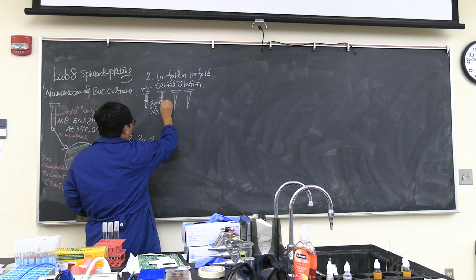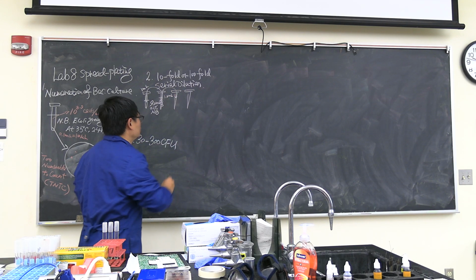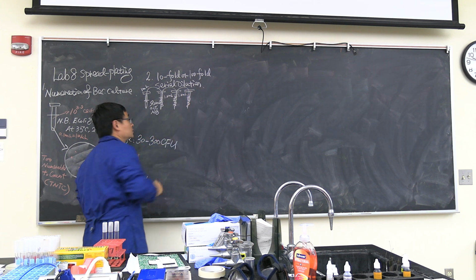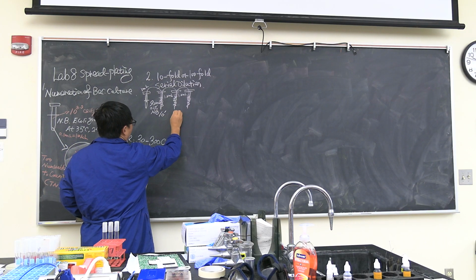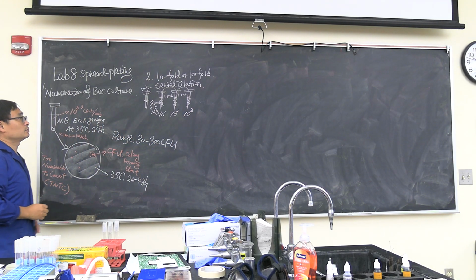Then we mix very well, we shake or vortex, and then add 1.0 ml to the second tube. We mix, shake very well, then we add 1.0 ml to the third tube. So what's the dilution factor for the tubes? It will be 10 to the power of 1, 10 to the power of 2, and 10 to the power of 3. That's a tenfold serial dilution.